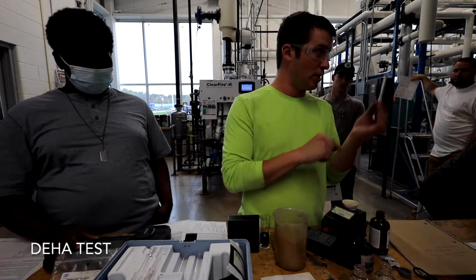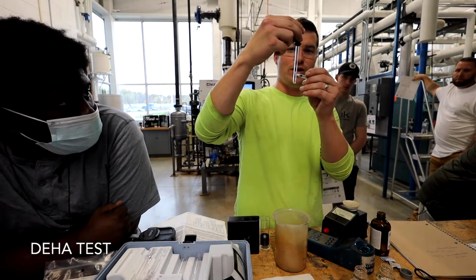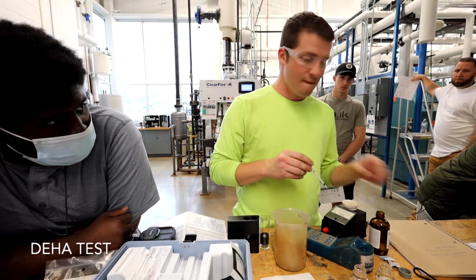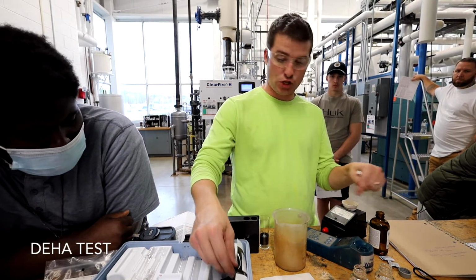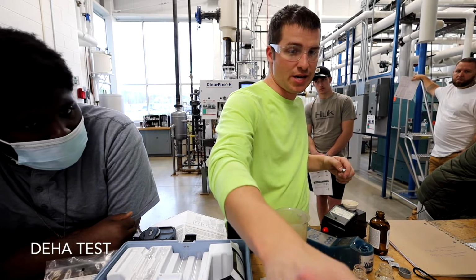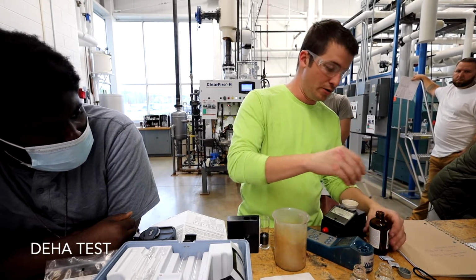You can easily measure out 0.5, right? And this you can do it, but that's a little harder. Do you have to clean the other one as well after you're done, or no? What I normally would do, yeah, you can see there's kind of some staining from this drying out on it. Will it impact it? Maybe, maybe not. I would actually just take a little bit of this and rinse it out when you're done. So we're gonna fill it up.